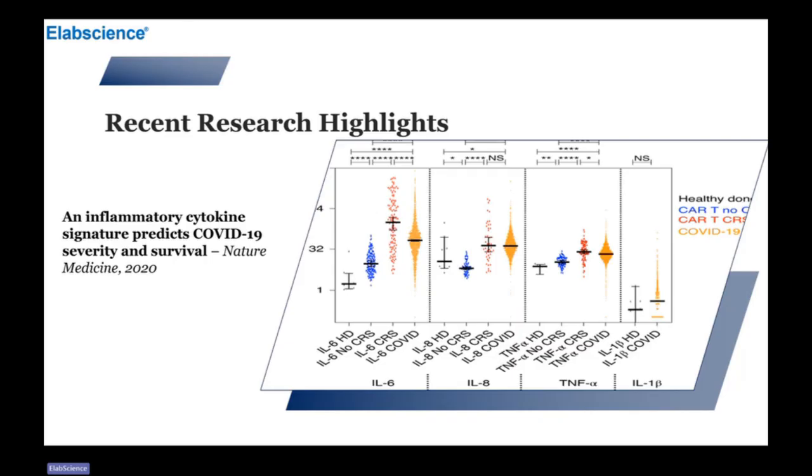By integrating ELISA with complementary assays like flow cytometry, Western blot, or qPCR, we can achieve advanced platforms, and researchers can uncover mechanistic insights, identify biomarkers, and support drug development. And ultimately, ELISA drives reproducible, impactful data that informs both science and patient care.